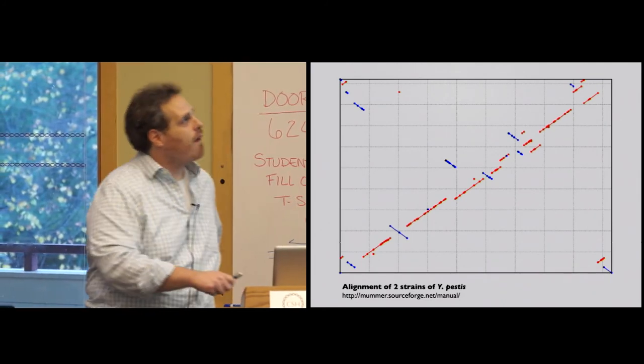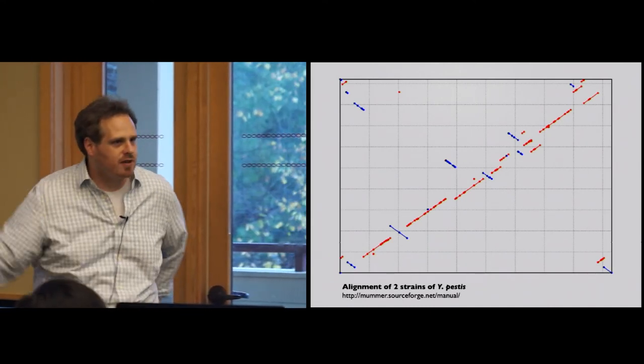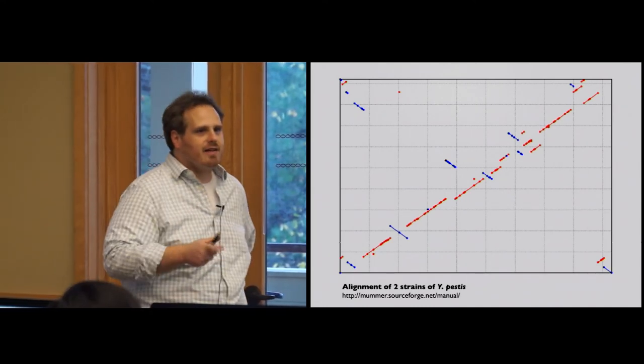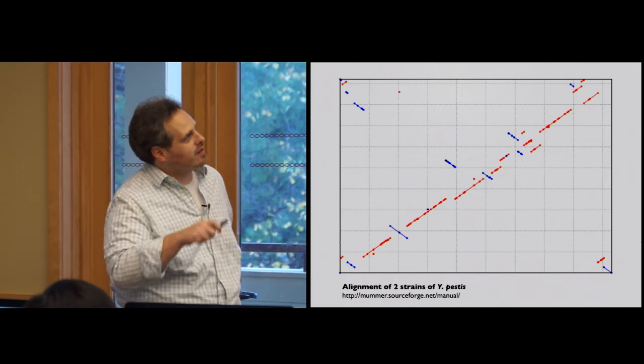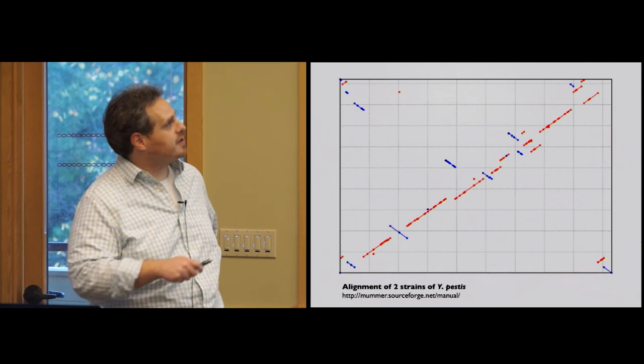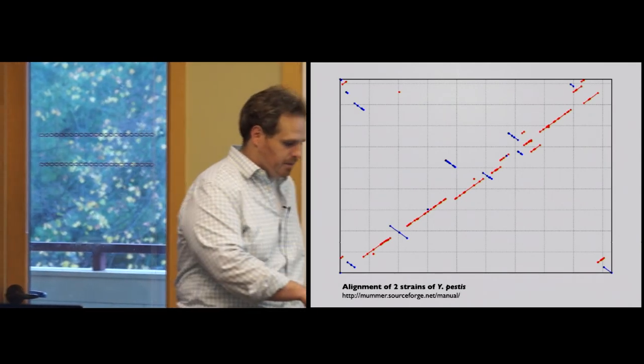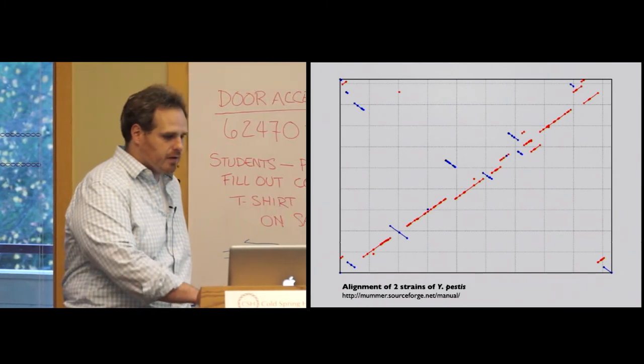What about the top left and bottom right? So many of the microbial genomes are circular. And if they're not exactly lined up at the origins of replication, you can get this sort of donut pattern or X pattern. This suggests that they're very closely aligned, but there was maybe a little bit of adjustment needed to take place.